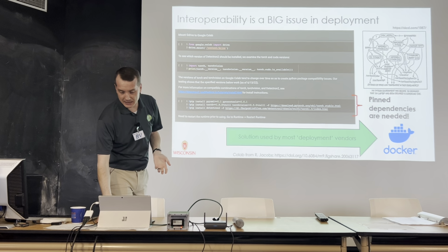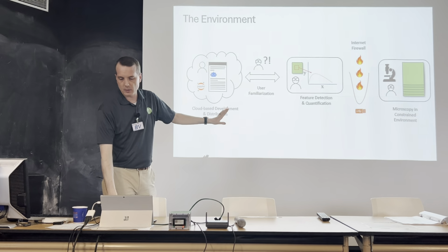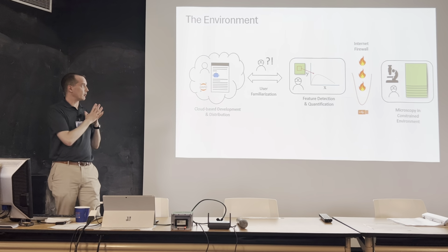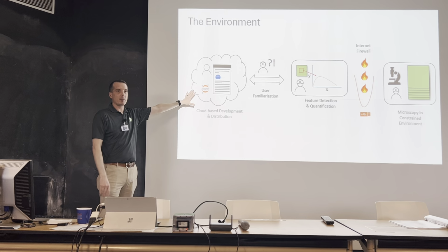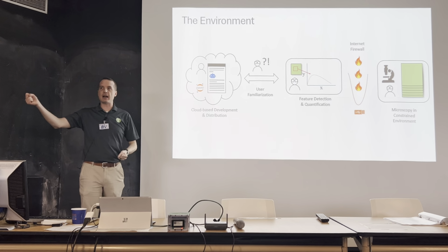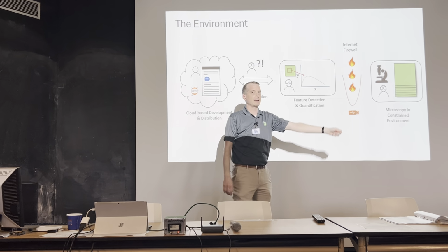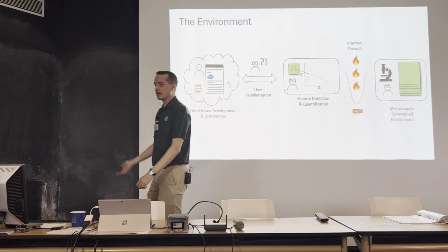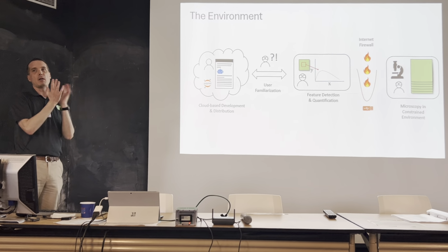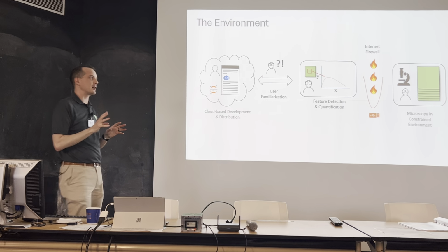Because in addition to all of these problems with machine learning deployment, you also have the environment that these microscopes are in. Machine learning really took off because of the cloud-based stuff. Google Colab is in the cloud. You're at your computer, you have internet access. You do not have that at the microscope. You don't necessarily want your microscope connected to the internet. Remember, they're running Windows XP, so of course you don't want them connected. But you're also not allowed to modify your microscopes. You'll void all your warranties and all your service contracts.